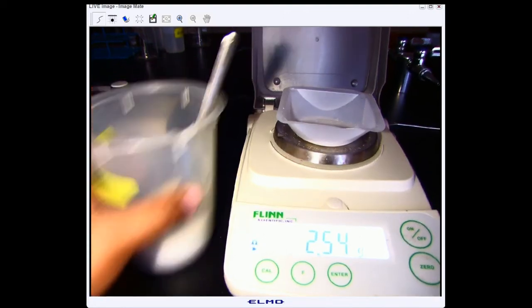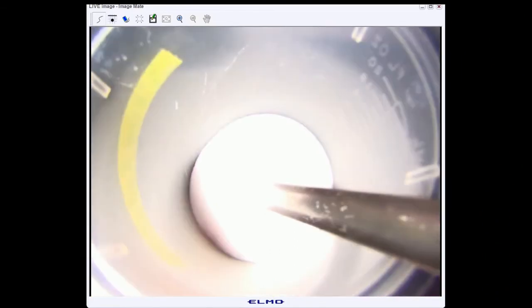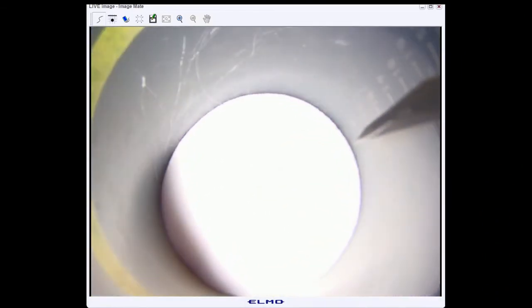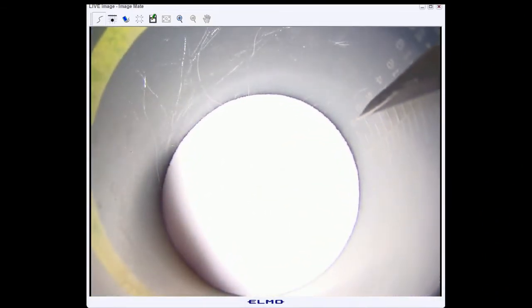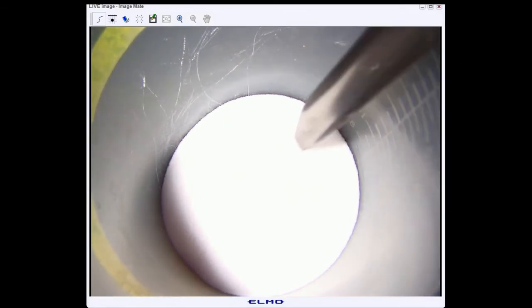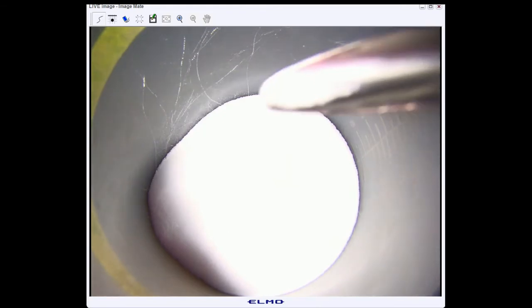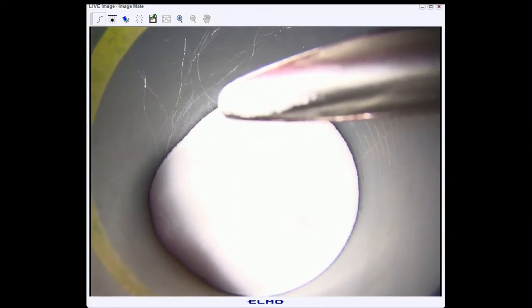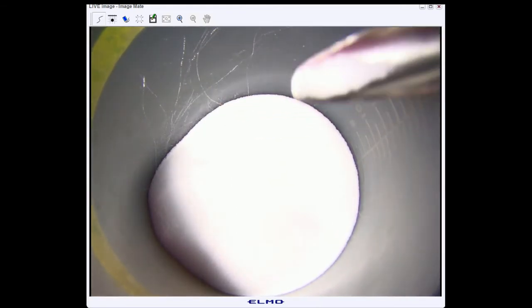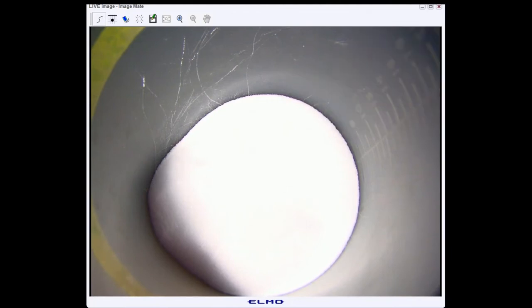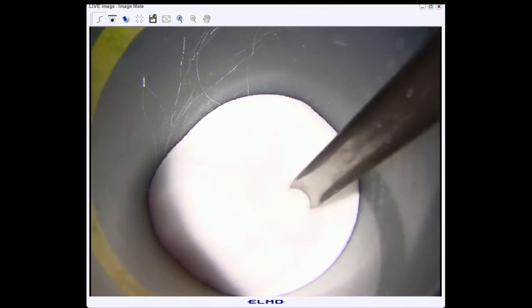Before we move on to our next step, let's get a close look at that baking soda. All right, so our baking soda is a solid. As you'll notice, it's white and it is very fine. So a very fine powder.